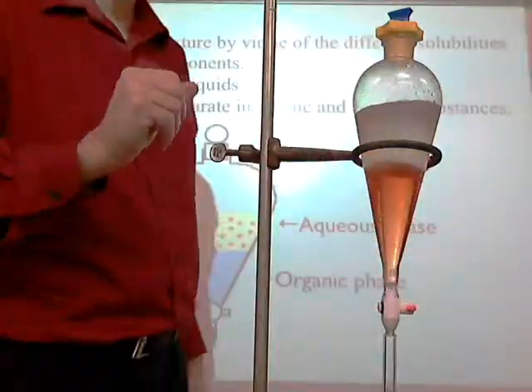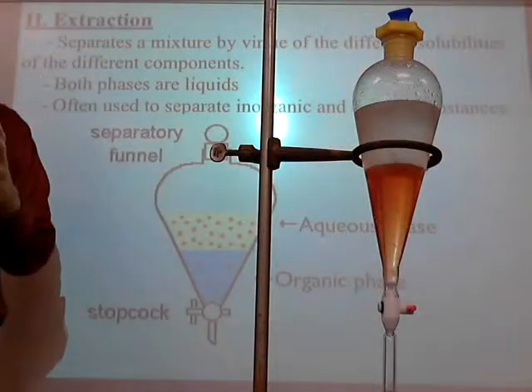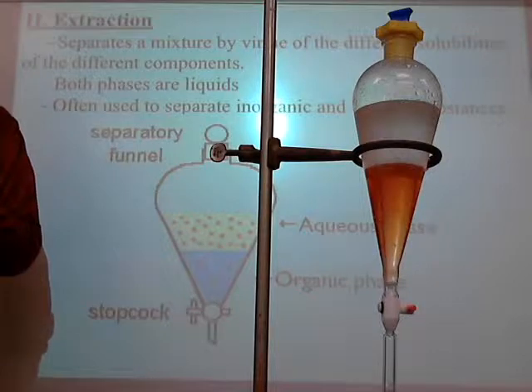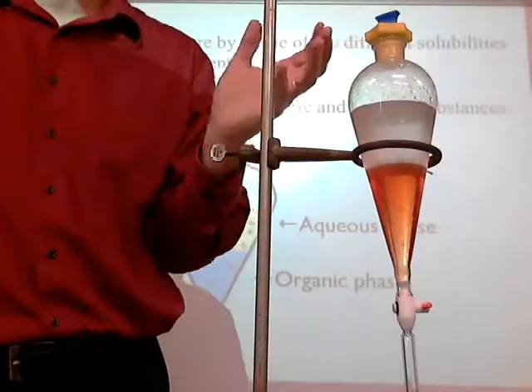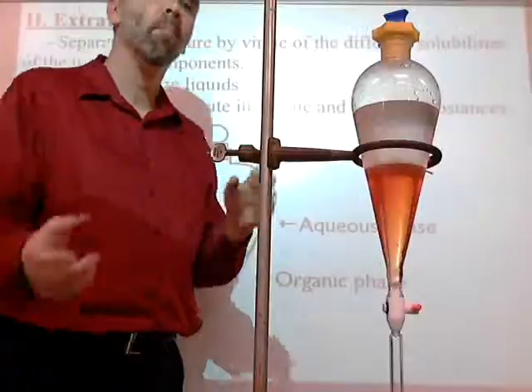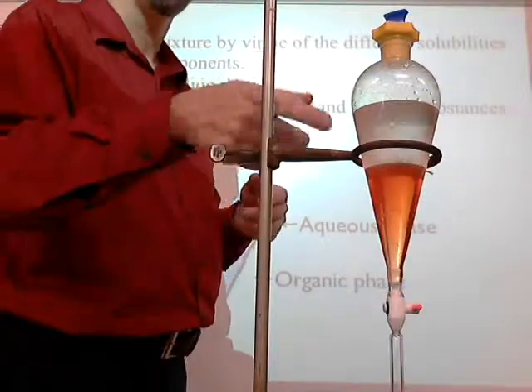Where's the red now? On the bottom. Now here's why. When litmus or phenolphthalein or any of those indicators turn color, they are turning color because there is some molecular change. In this case, that change in their structure with the pH actually caused him to become more non-polar. More organic. It dissolves better in the organic than in the aqueous, and that's why he's down at the bottom.